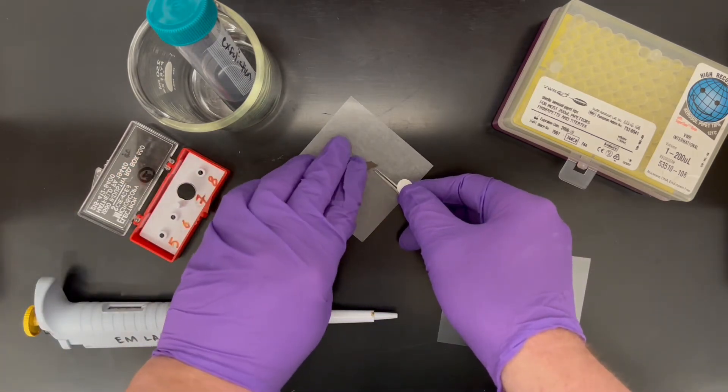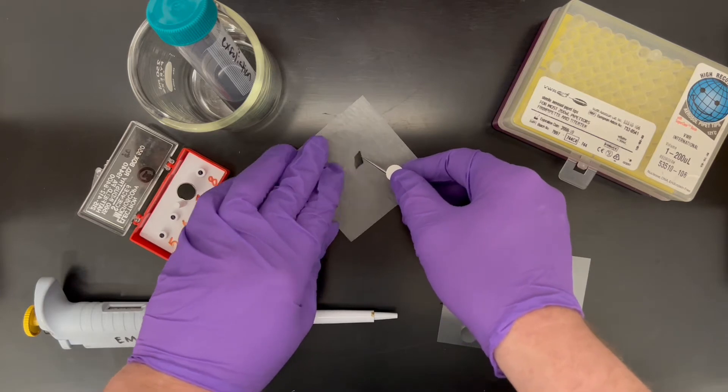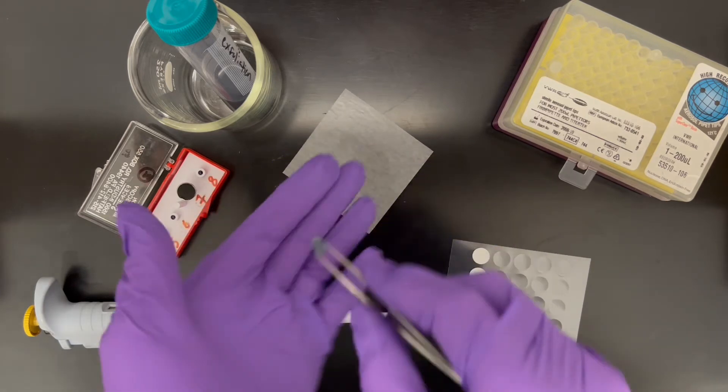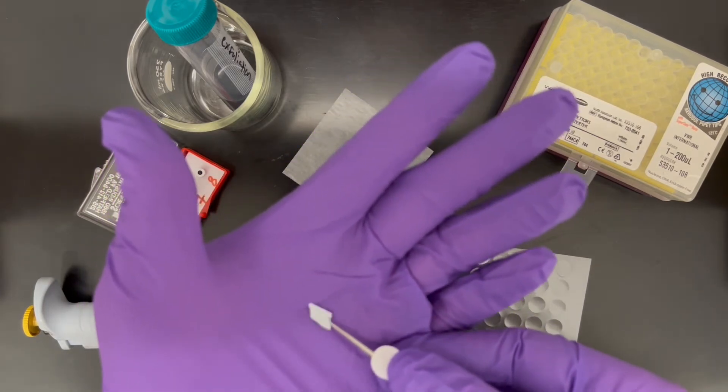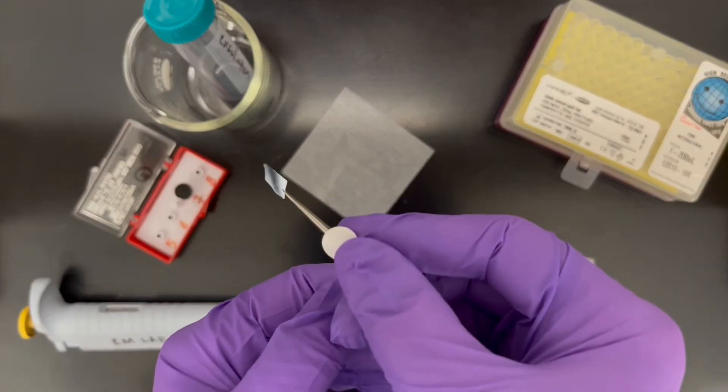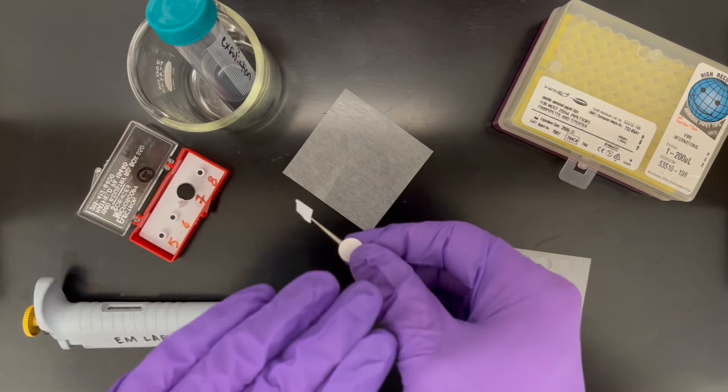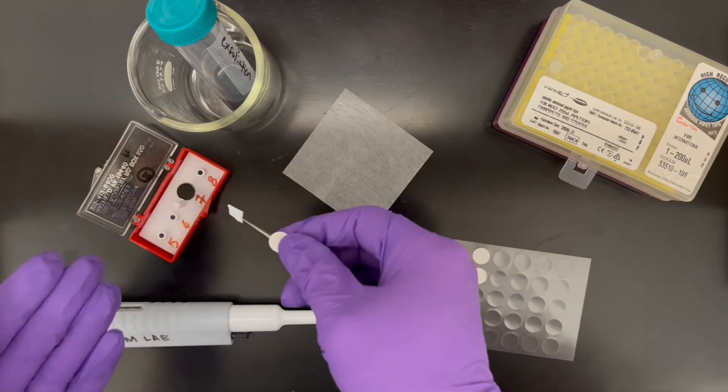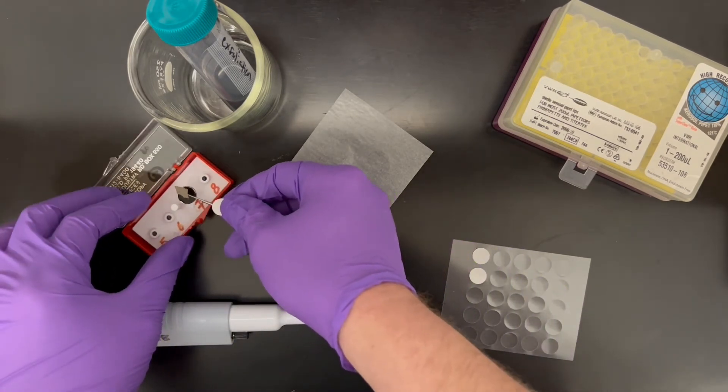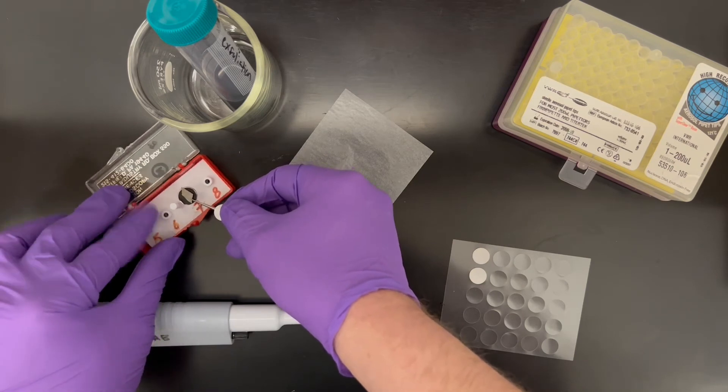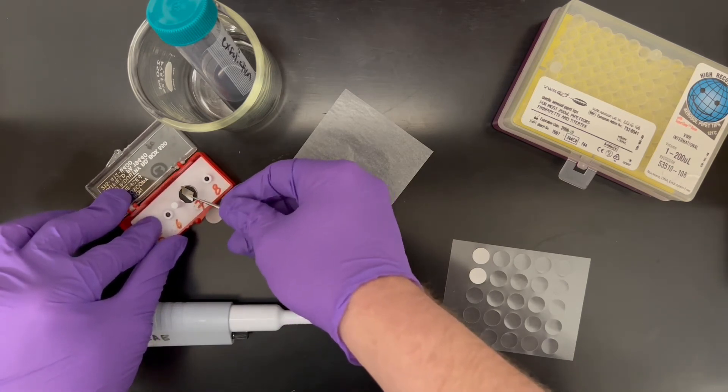Then we'll take our silicon wafer and make sure it's shiny side up. That's to make sure that the flattest side is the side we're imaging on. Press it into the pad.